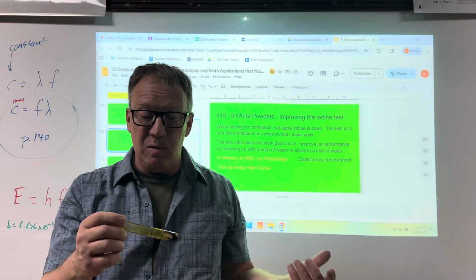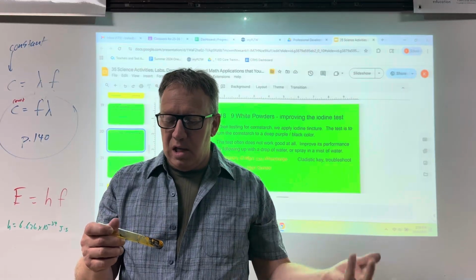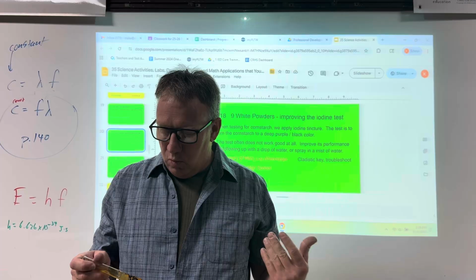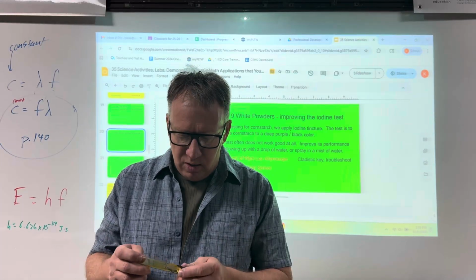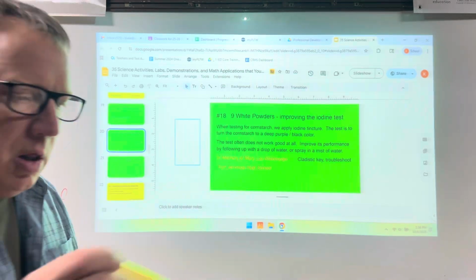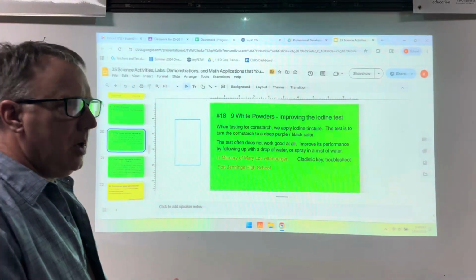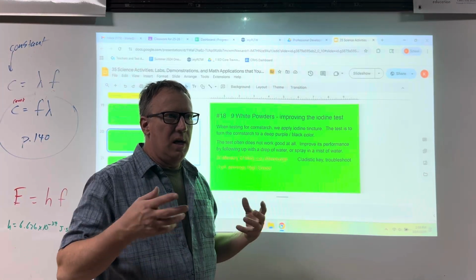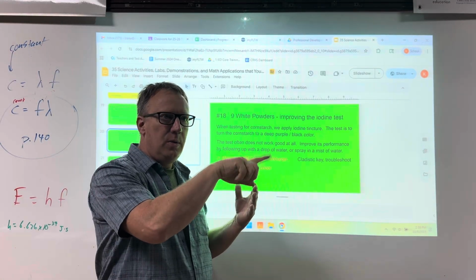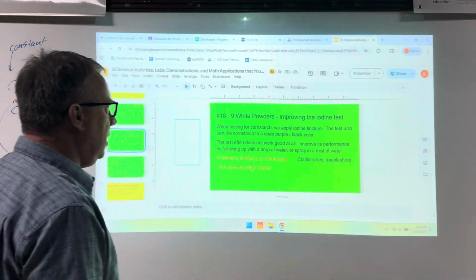I don't know the chemistry behind that. I haven't looked into it. It might have something to do with the ethanol being too water absorbent. It's too miscible with water. It's taking up the water, I don't know, and it needs a little bit of water anyway to do this. A little bit of water will give you the brown. So one thing I haven't tried that I think would work great is to take a spray bottle, that mist, and mist that in there, and I think it'll make purple as the vapor goes in.